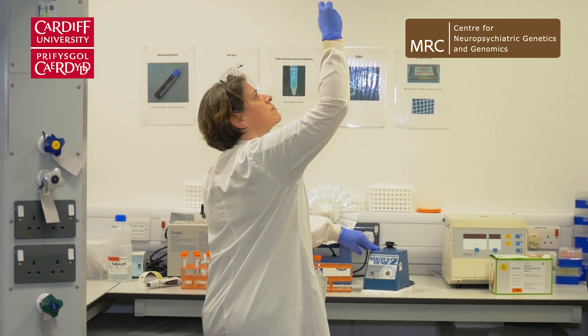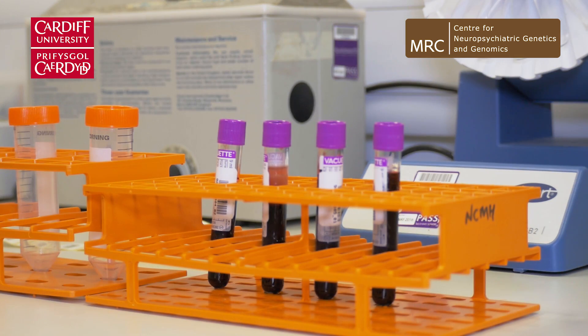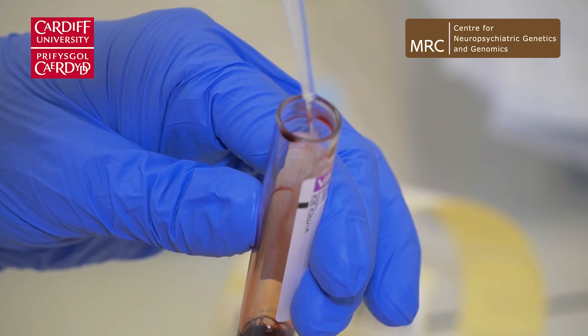We get bloods coming in from our participants and we need to extract DNA from those bloods. Red blood cells don't contain any DNA, so the first thing we need to do is get rid of those, and we do that by breaking them open with a sugar solution.